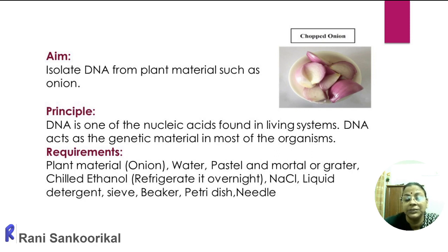The second step is chemical breaking, chemical lysis, we can say. How can we lyse the membrane? By making it more permeable and causing more lysis of the cell walls, because it is plant material, a cellulose cell wall. So it will not be crushed properly mechanically. So we are applying a chemical.